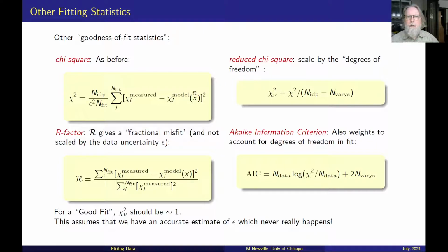When comparing fits, you'll usually see that between different fits, you'll decide that the best fit is the one with the lowest reduced chi-square. It's often also the case that AIC and the Bayesian information criteria that are similar to that are also the lowest for that fit. But if they differ, then that might suggest that the differences between successive fits may not be very significant.